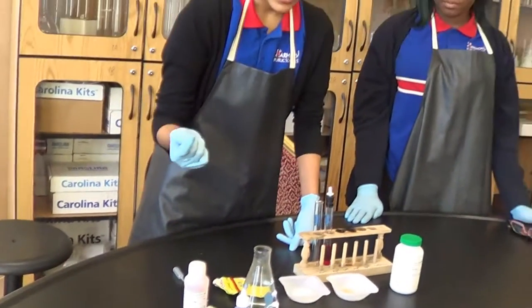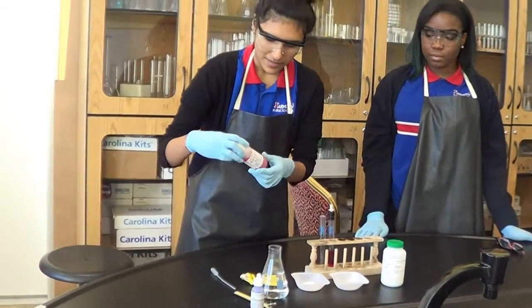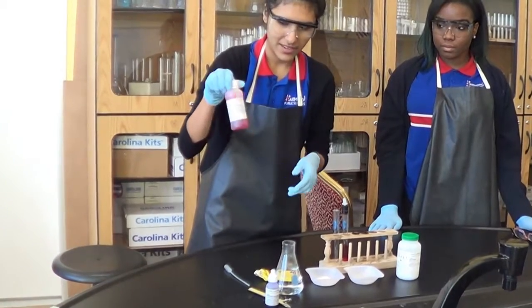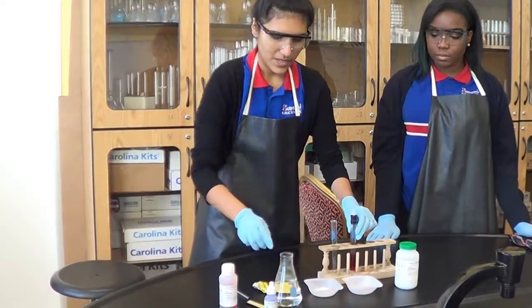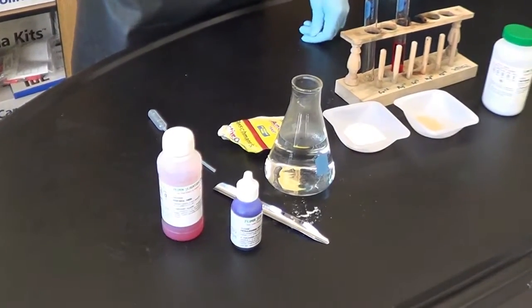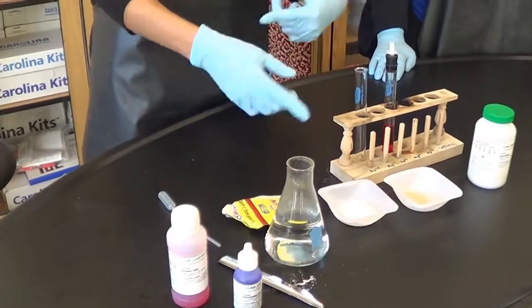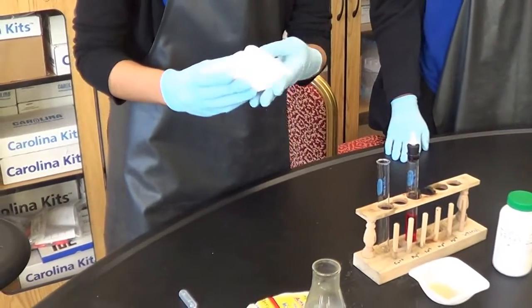will be the transfer of carbon dioxide between the phenol red solution, which is right here, and this color is only used to notice the difference when the carbon dioxide has exchanged. So yeah, we will add our glucose.